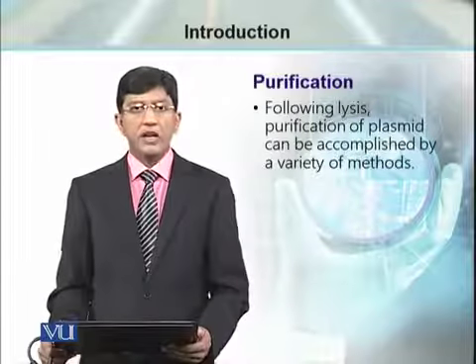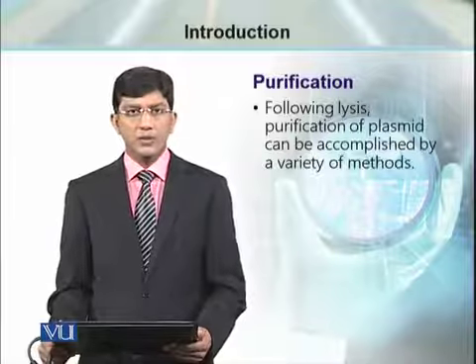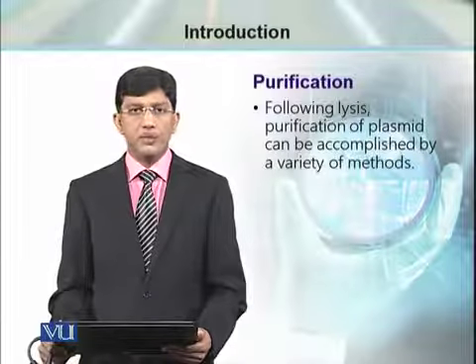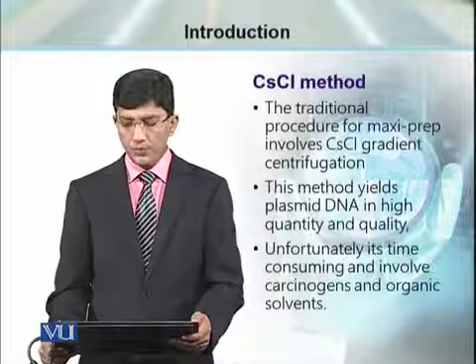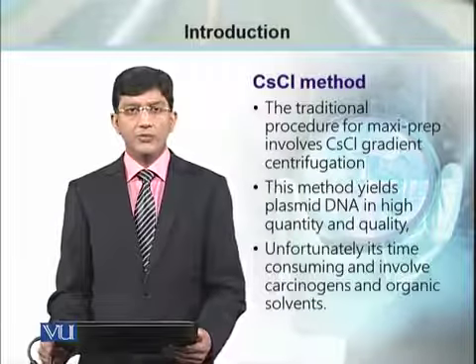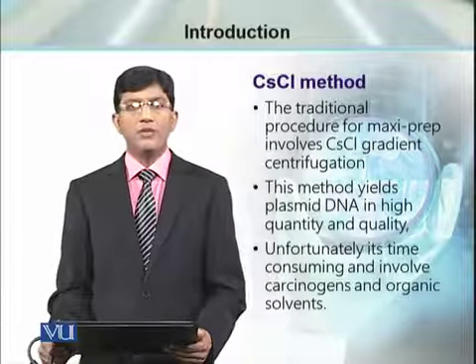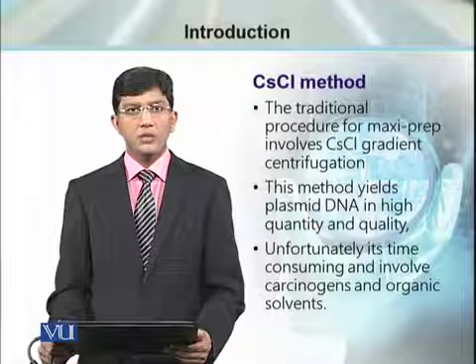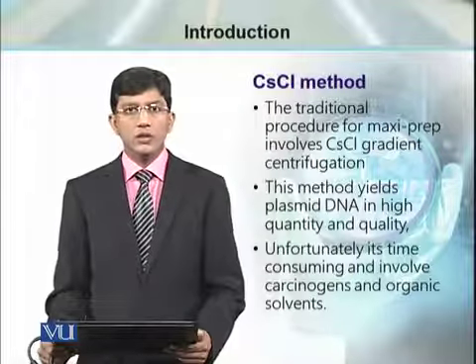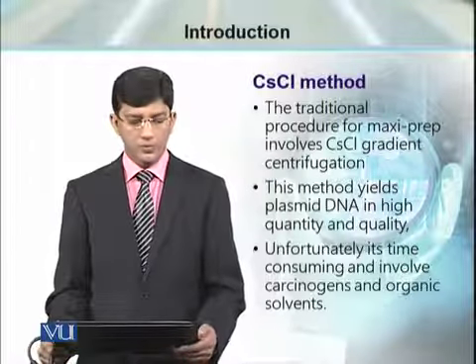Once lysis is done, this mixture should be processed further for purification of the plasmid DNA. We have different methods established in the labs to isolate or purify the plasmid DNA, the most common of which is the cesium chloride method. This is the traditional method used in the labs for separation and purification of the plasmid DNA. However, nowadays this method is not preferred because it involves the use of toxic chemicals like ethidium bromide or organic solvents like phenol.